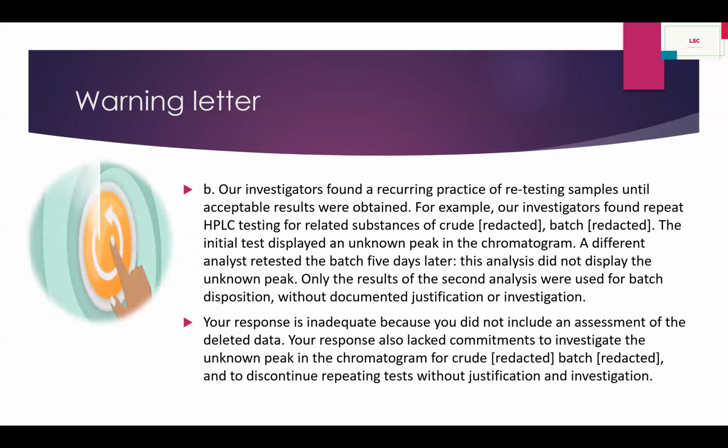Our investigation found a recurring practice of retesting samples until acceptable results were obtained. For example, our investigation found repeat HPLC testing for related substances of a batch. The initial test displayed an unknown peak in the chromatogram. A different analyst retested the batch 5 days later, and the analysis did not display the unknown peak. Only the results of the second analysis were used for the batch disposition, without documented justification or investigation.